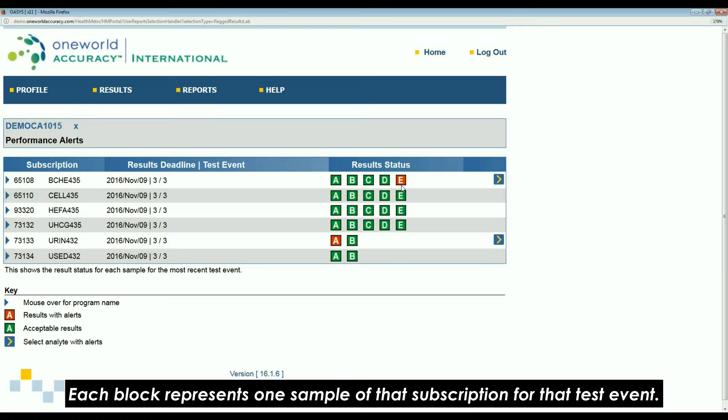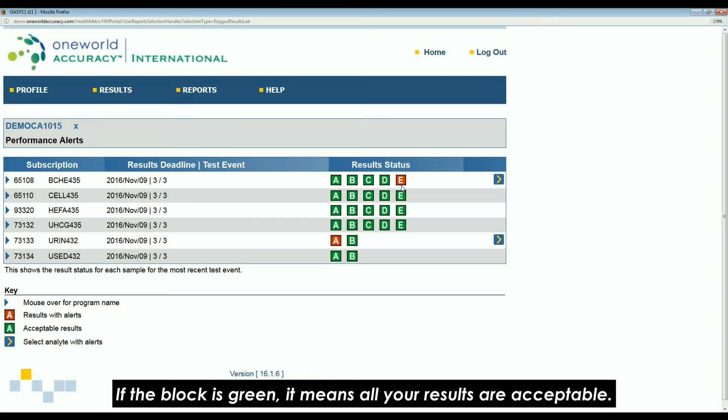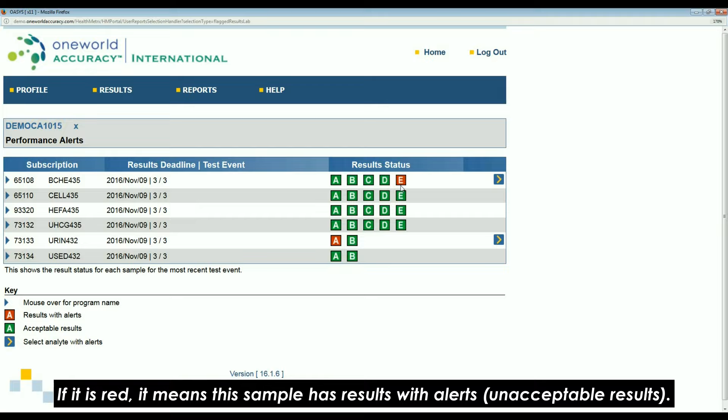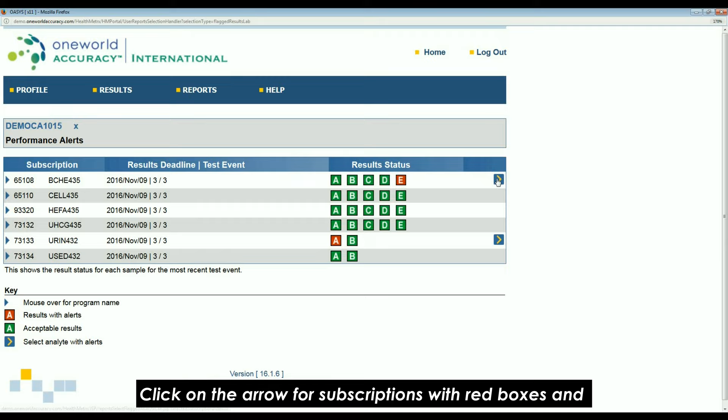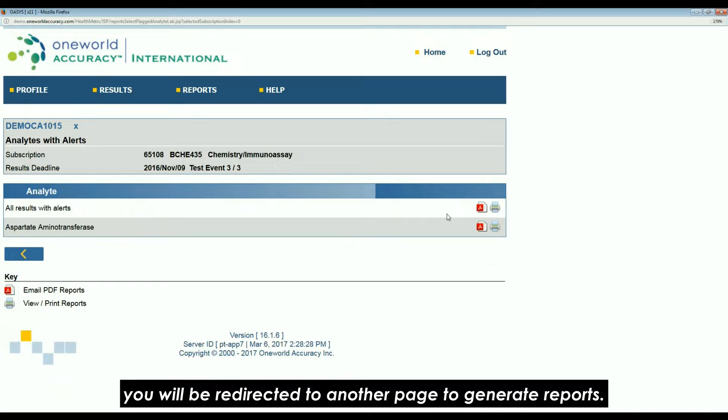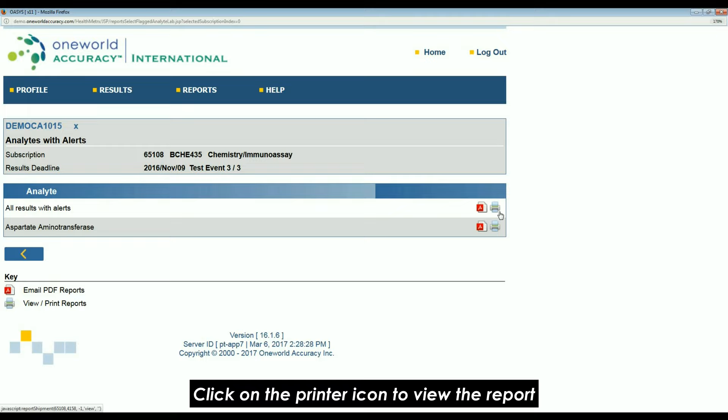Each block represents one sample of that subscription for that test event. If the block is green, it means all your results are acceptable. If it is red, it means this sample has results with alerts. Click on the arrow for subscriptions with red boxes and you will be redirected to another page to generate reports.